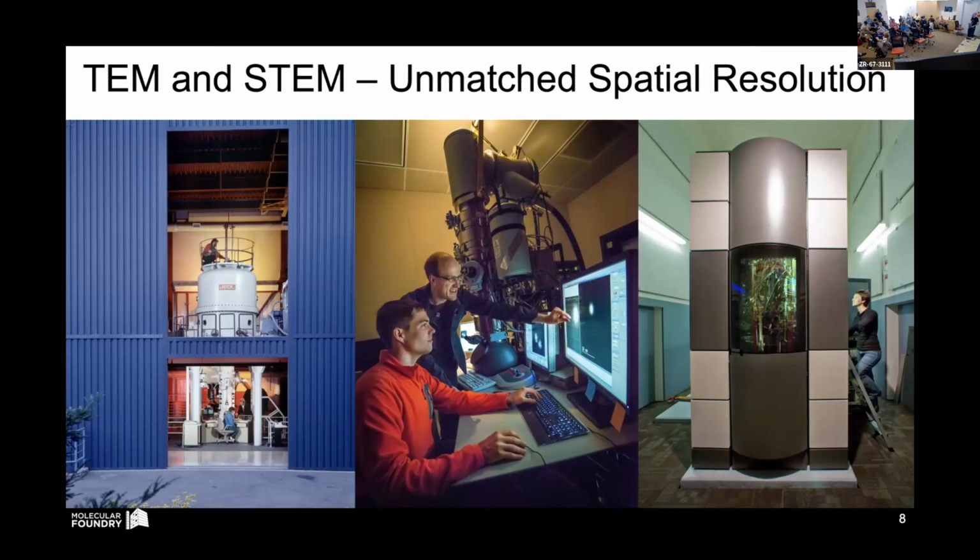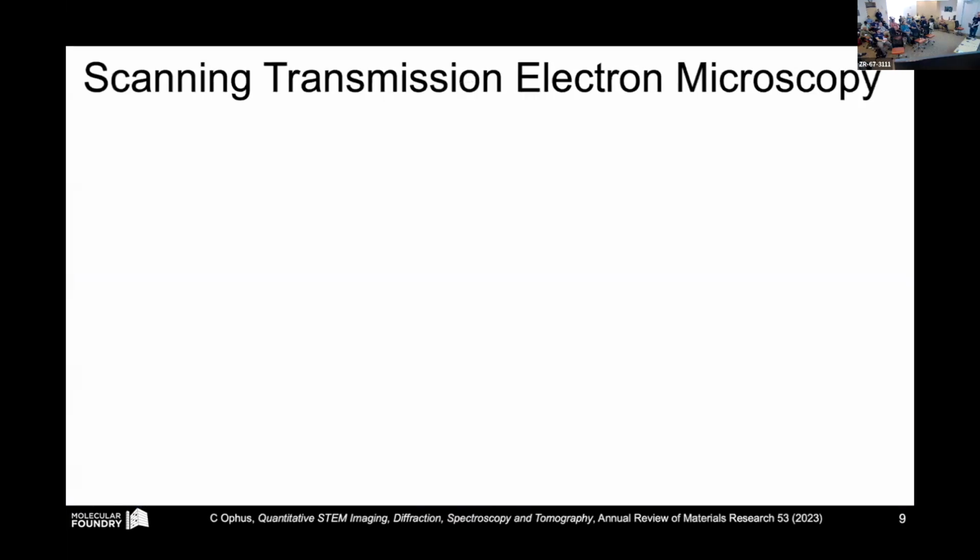Our new spectra should be installed by the end of the year here too. So the next generation. Even that one on the far right there is still 15 years old. NCEM has very, very old hardware compared to most microscopy facilities.